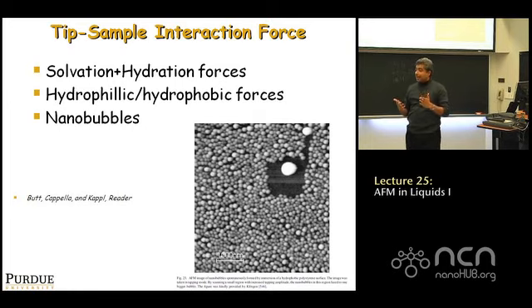That has to do with the fact that when the tip-sample gap is so small that just 2 or 3 or 4 layers of water remain between, the water is not this free tumbling water anymore. When you confine water in a gap of, let's say, 3 or 4 angstroms, you're going to get pretty much layered water, very much like ice. It becomes almost semi-crystalline. You can think of it also from the point of view of a crystalline substrate.